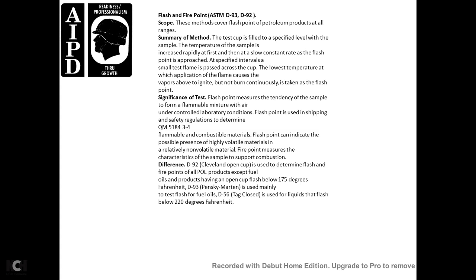D93, Pensky-Martens, is mainly a test of flash point for fuel oils. D56 is used for liquids with a flash point below 220 degrees Fahrenheit.